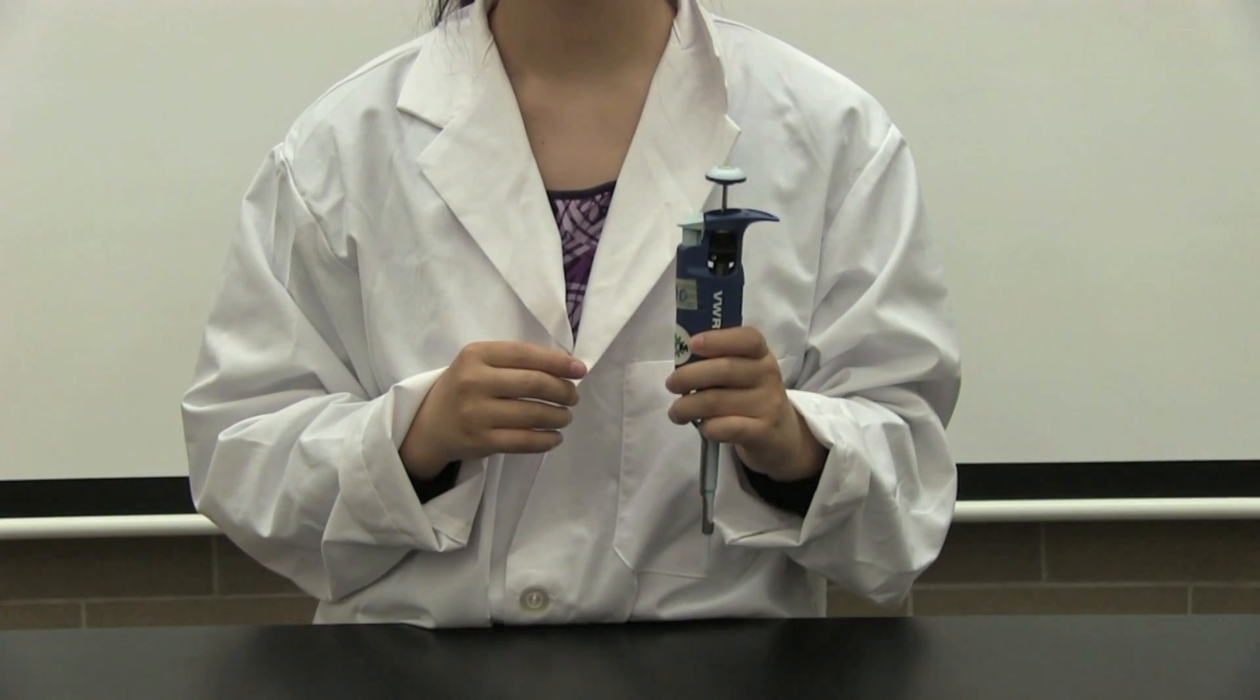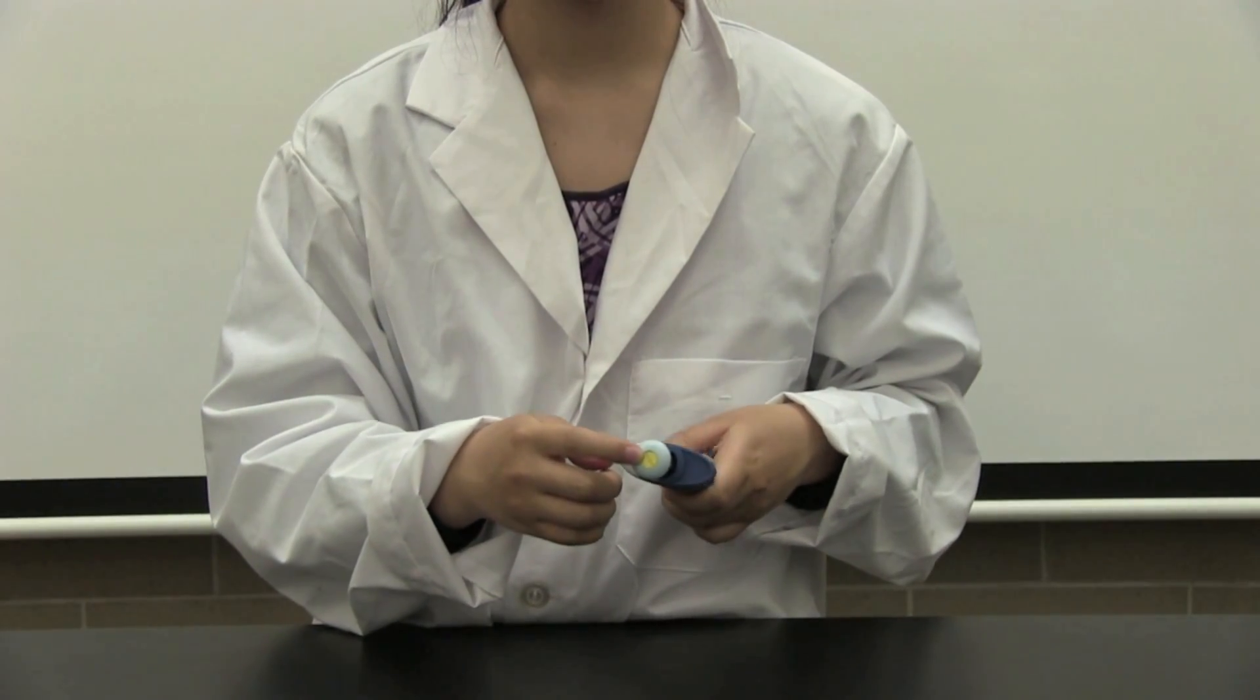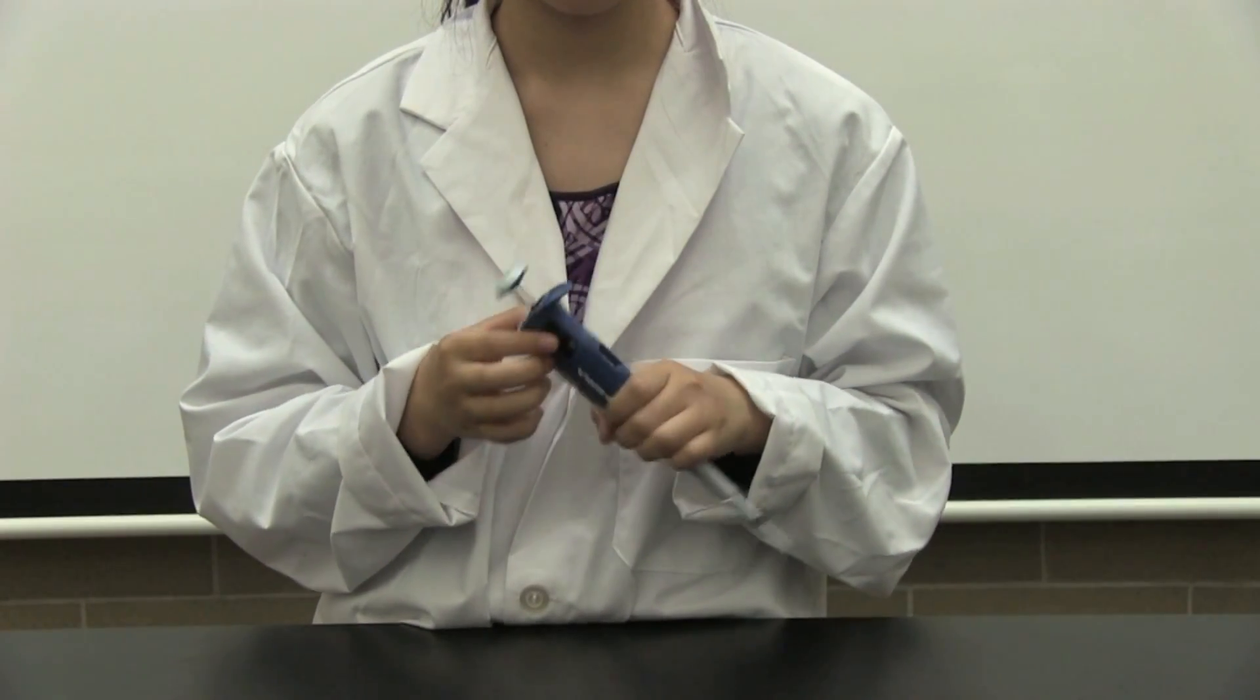When we get our micropipette, it is important to check its size at the top of the micropipette and adjust its volume by spinning the dial.